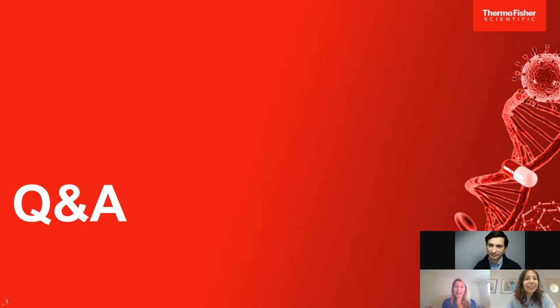Great. And another related question is, how much work was it to establish this workflow for your research? And is it routine for you now? Yeah, I'm happy to say that it's routine now in the lab, definitely. But when I started this project, it depends, because I started from scratch, so I didn't work with EM before, so I had to learn how to handle EM grids, which was very difficult in the beginning.